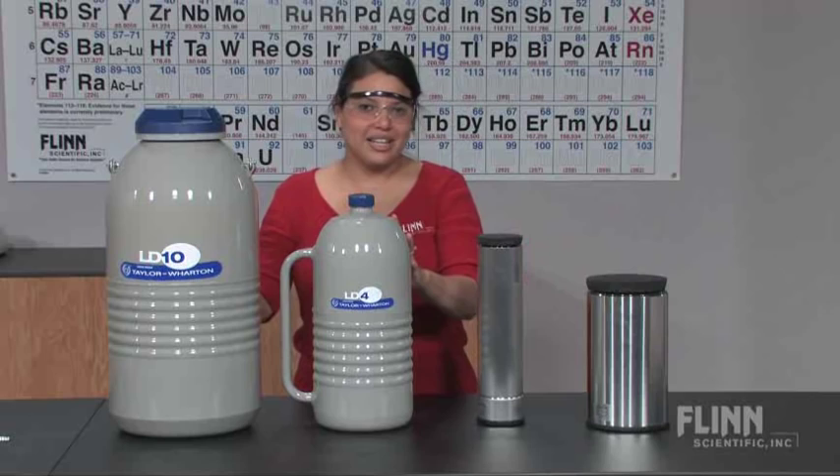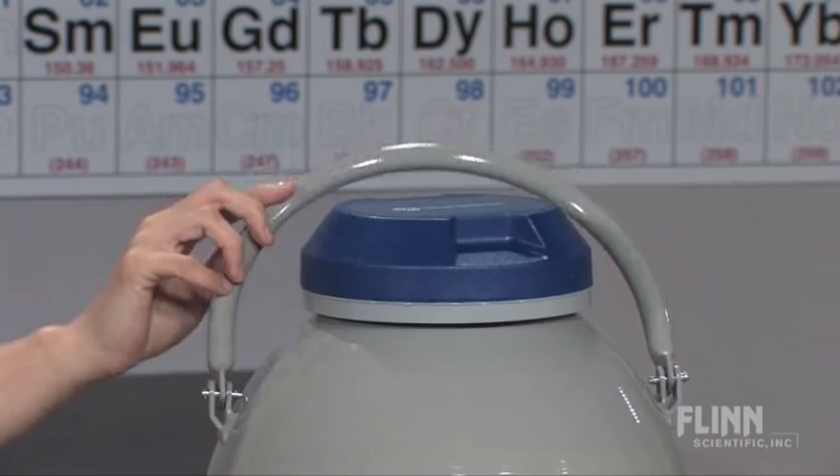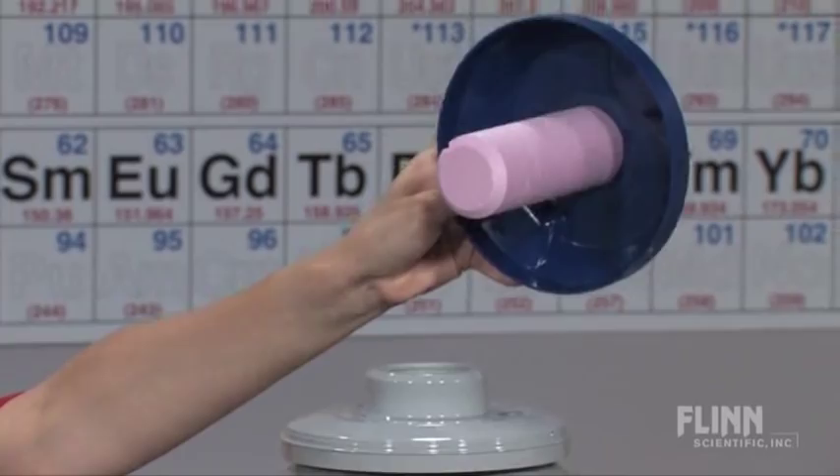Larger 4 liter and 10 liter Dewar flasks are also available. These are recommended when you want to store liquid nitrogen for longer than 24 hours. The large Dewars have a handle for easy lifting and moving, and all Dewar flasks have a special vented polypropylene stopper to minimize evaporation.